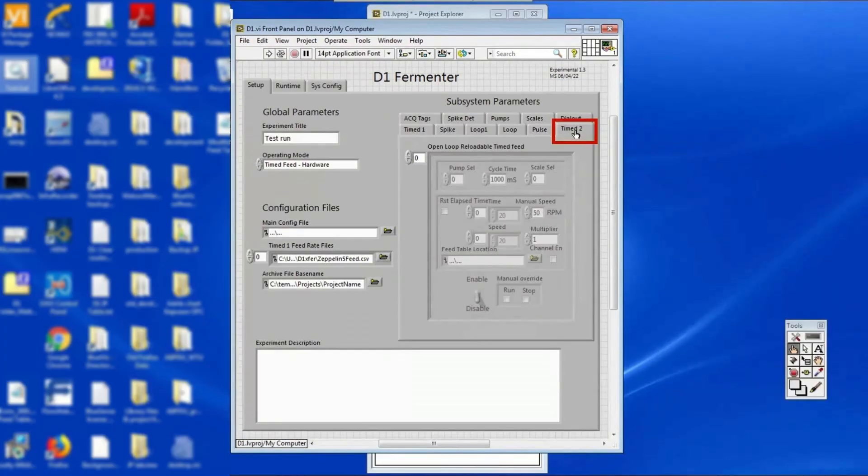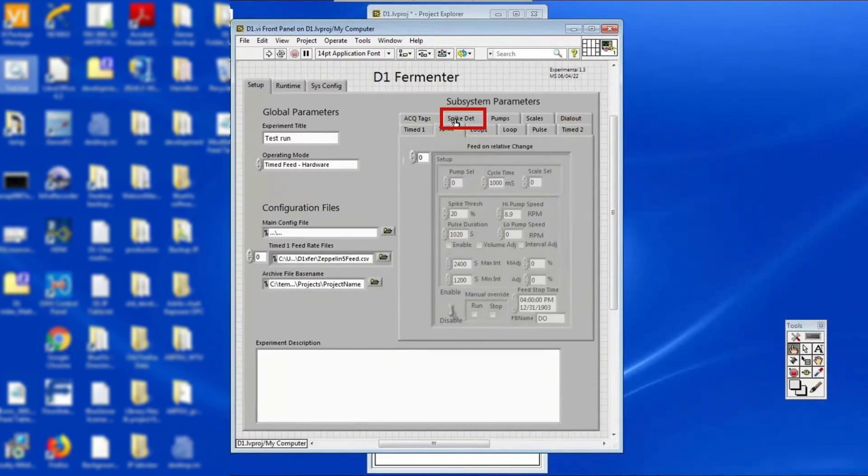Next, activate the feed strategy. Still under the subsystem parameters, two feeding strategies can be selected. Timed 2 and spike det or detection. Timed 2 is an open loop or loadable time feed that follows the .csv feeding strategy file that you selected earlier.